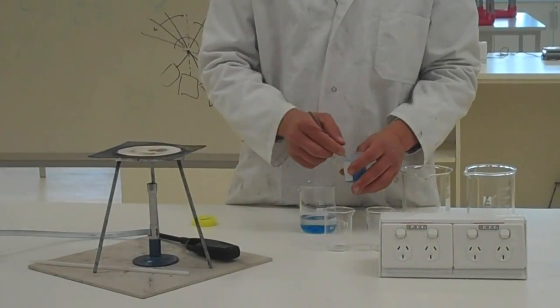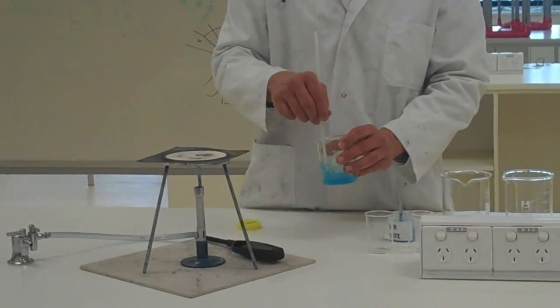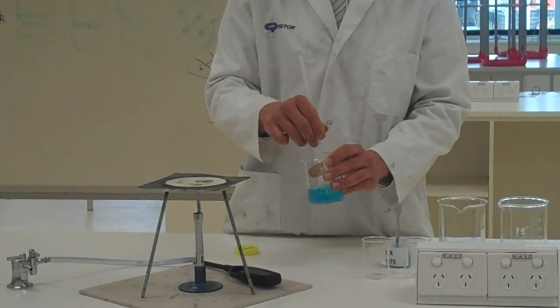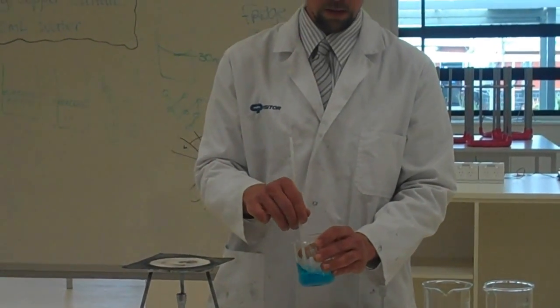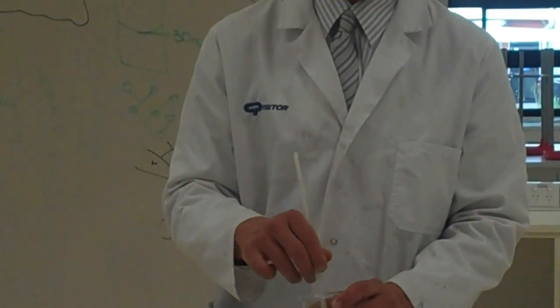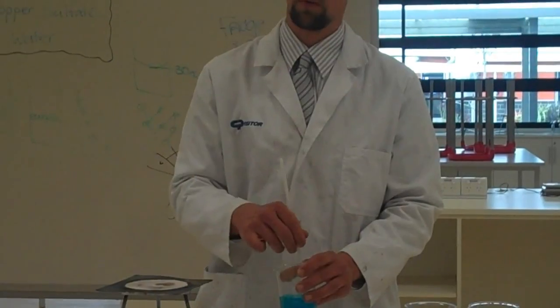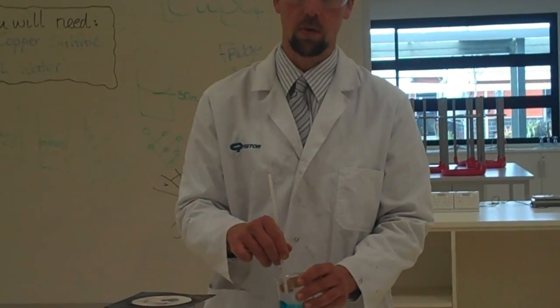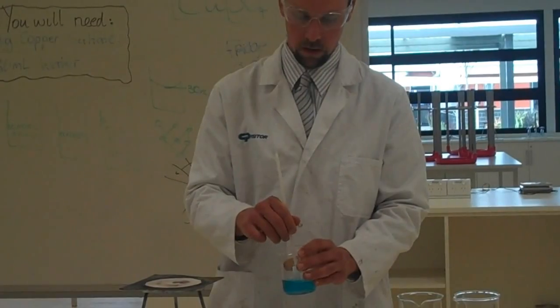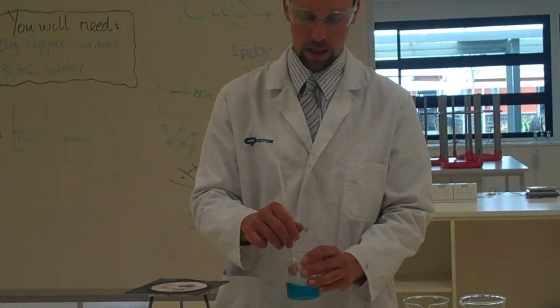I'm going to start with three spoons and work from there, stirring with this stirring rod to dissolve. How do I know when the solution is saturated? When no more copper sulfate will dissolve — that means every particle of water will be clinging on to a particle of copper sulfate; it just can't hold any more. That's what's known as the solvent being saturated with the solute.